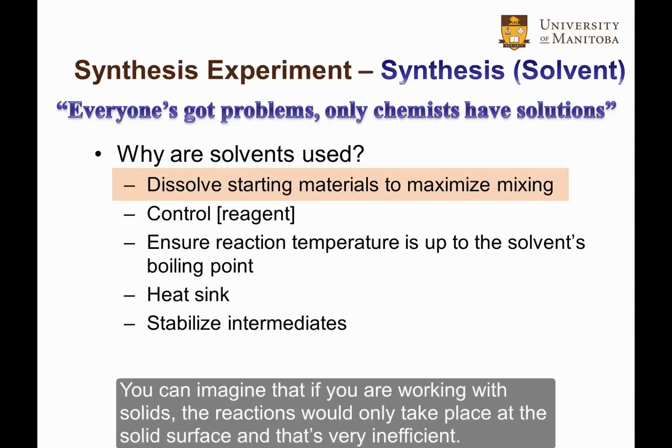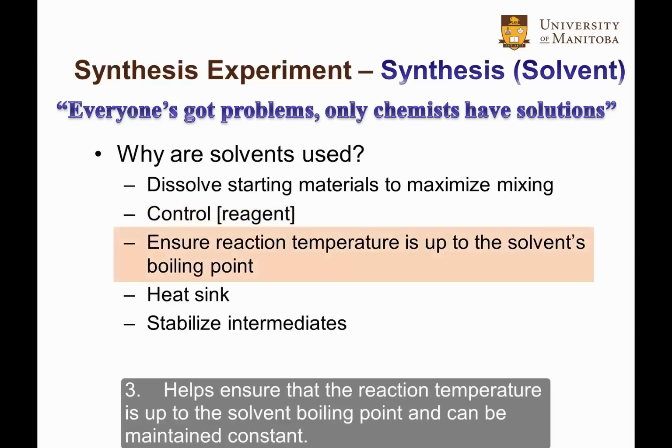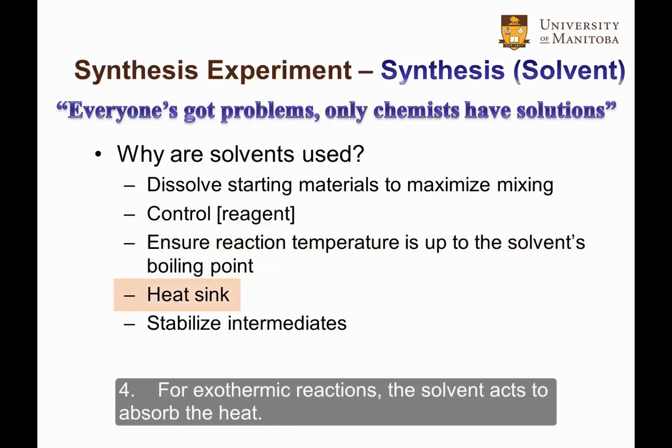You can imagine that if you are working with solids, the reactions would only take place at the solid surface, and that's very inefficient. 2. Some reactions are sensitive to the reagent concentrations, and using a solvent dilutes their concentrations. 3. Helps ensure that the reaction temperature is up to the solvent boiling point and can be maintained constant. 4. For exothermic reactions, the solvent acts to absorb the heat.